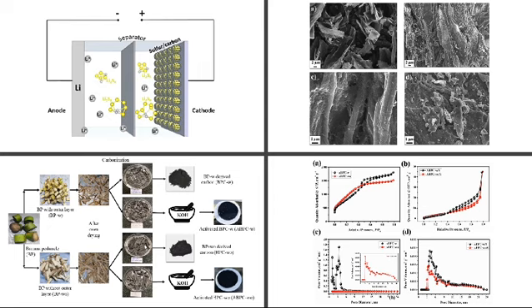The first image shows the scanning electron microscopy images and it confirms the flake-like morphology. This morphology will help in accommodating more sulfur as well as diffusion of lithium ions. Later, I did the BET analysis for evaluating the surface area. From this physicochemical analysis, I found that it has flake-like morphology, high surface area and pore volume. Also, the pore size is in the micro-mesoporous range. This all helps in trapping the polysulfides.